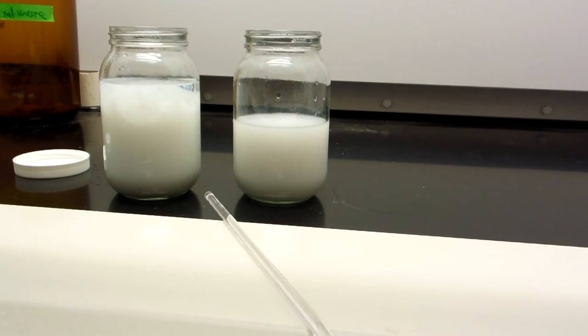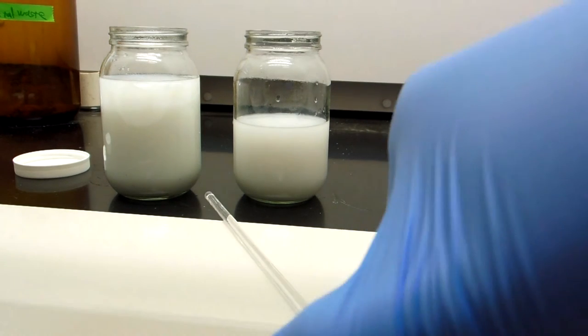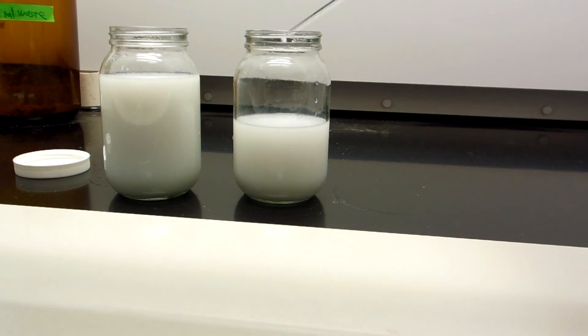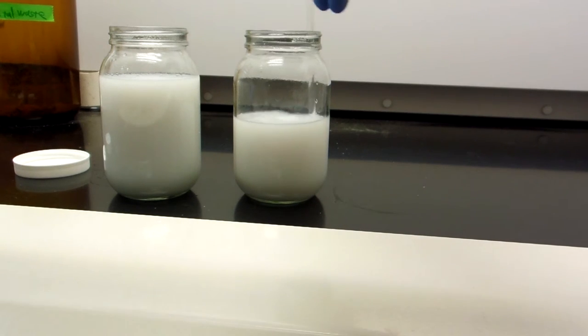I'm going to reposition the camera. So I add a second pour of sodium chloride. And I stir. Sorry about the dogs, they bark a lot. And so I add an additional amount of sodium chloride in the smaller volume of liquid, as I feel like it is more concentrated in values.